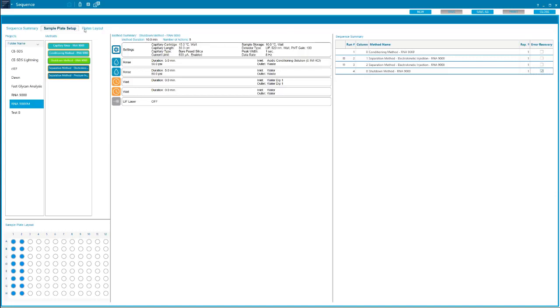In the next tab, we have our 96-well plate, our outlet plate, our reagent plate, and our outlet plate. All of our reagents are in different places and the software orders this based on how they're being used — first a water rinse, then acid rinse, then gel rinse, water dips, separation, water dip again. Because BioPhase software was designed so well, you can drag these to wherever you want — they're not static locations, everything is dynamic.